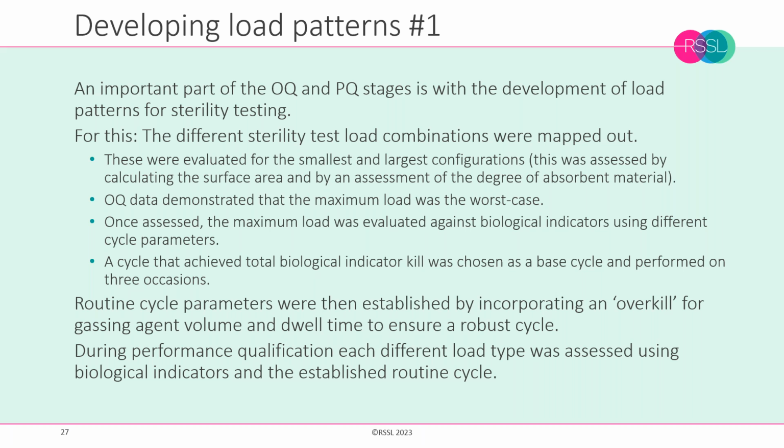But we need some form of rationale to decide how we're going to approach that, and the magic rule of validation applies in that we should be repeating that at least 3 times, and maybe more often in the case of isolators, because they're not quite as reproducible or repeatable as something like an autoclave is. But again, that's going to be a matter for your internal company policy.